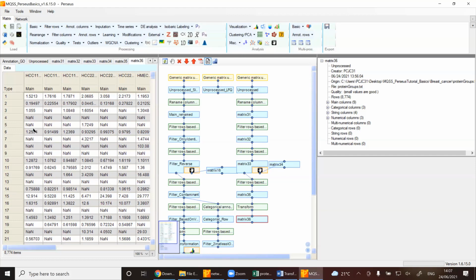If the heavy labels are heavily enriched, you might have a ratio of 0.25. And the ratio of 0.25 and the ratio of 4 are actually the same fold change, just in different directions. But without doing this log transformation, you cannot really see that. And also, if there is 0, you would think, okay, basically nothing has changed. But at the moment, that's not true. If you have 0, you have really heavily enriched the heavy labeled ones.